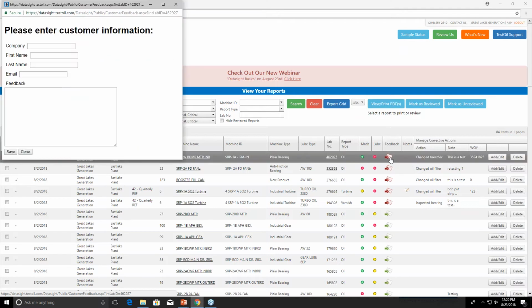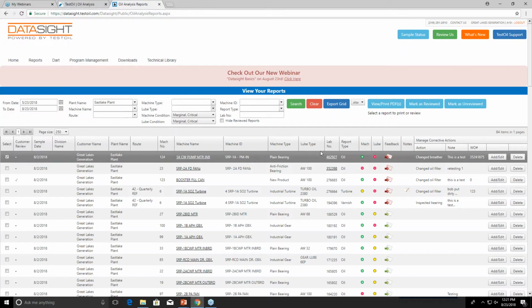And of course, there's a feedback form here. If you click on that, you just type in your information here, your email, and any questions that you have regarding your lubricant condition. If you're looking for any kind of advice or any questions for the analyst team or the CES department, you can go ahead and submit this here. This will generate a feedback form to us. It actually has the report number attached to it as well, so we can pull that up and take a look at it and go over any questions that you may have. And if you hover over that, you can see a general idea of what the feedback that you'd sent was.